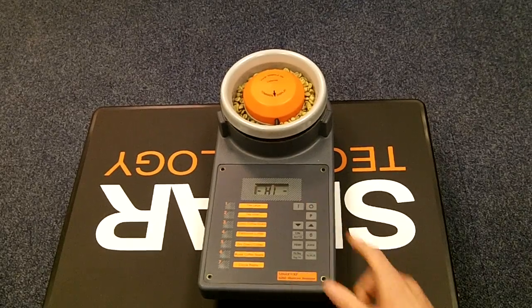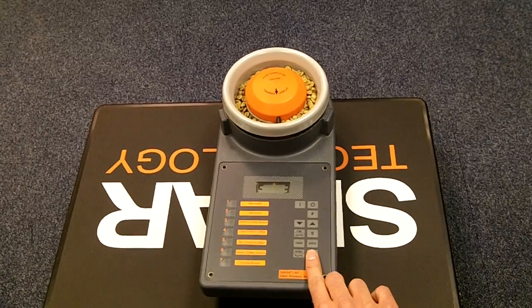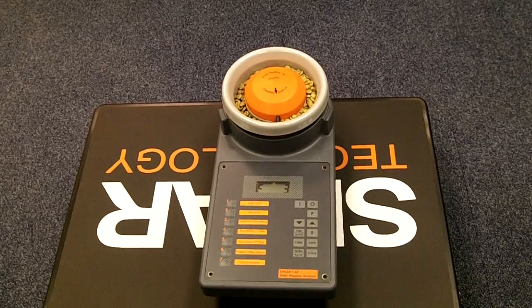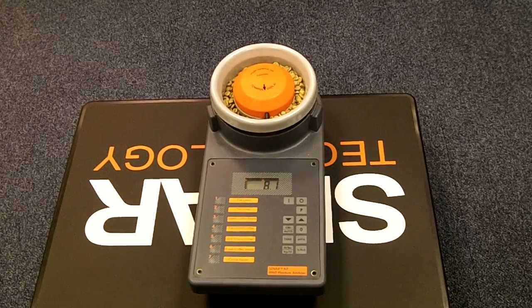Switch the instrument on and choose your commodity from the list on the side. Push the %H2O button to take a moisture reading and you should get a result in about 6 seconds. The moisture of this sample is 8.1%.